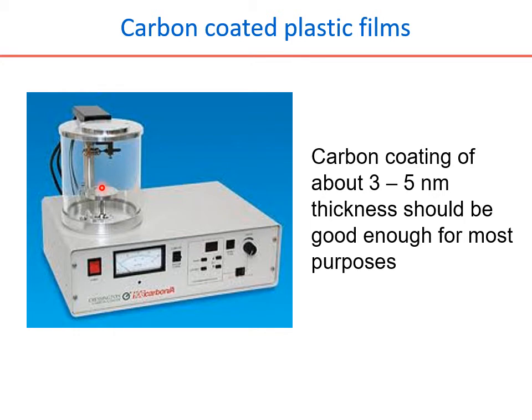By looking at the contrast between these, you know the carbon coating will give you a gray scale. By experience, you can look at the optimal grayscale, and you can stop the experiment whenever the required gradient of the grayscale is obtained here on the copper lid.